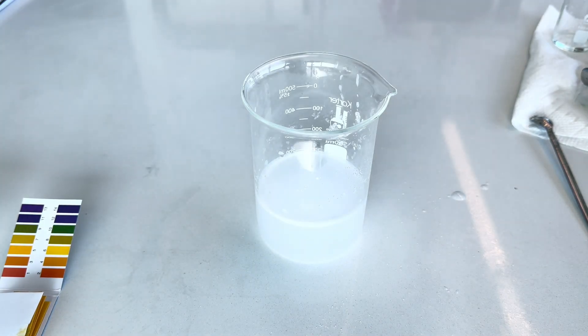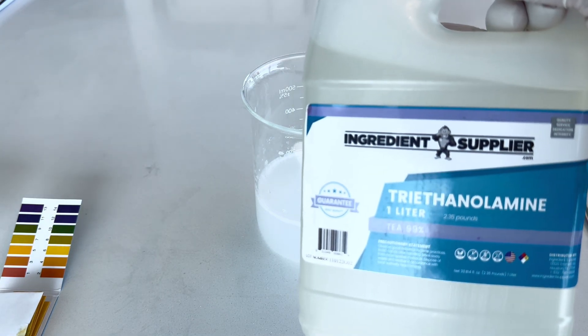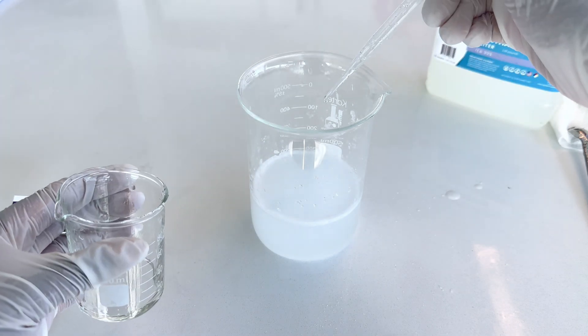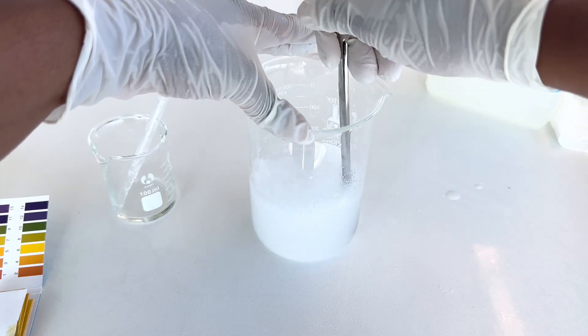Carbomer becomes more viscous at a neutral pH, so I will use the ingredient TEA, or triethanolamine, as a pH adjuster. I add in TEA five drops at a time to slowly raise the pH.